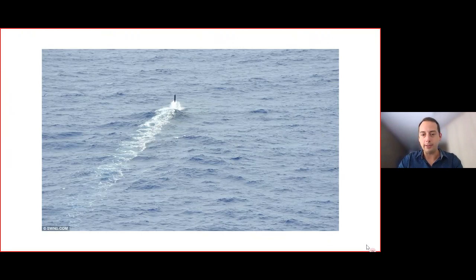And in many ways, this is how we look at the proteome today and have been looking at the proteome for the past 2 decades. The idea being that we see some parts of the proteome, but we are also keenly aware that certain parts of the proteome remain hidden from us. And so one of the nice things that we can do once we have machine learning tools available is that we can get a broader picture of all of this proteome information that is currently remaining hidden. And so that is what I'm going to be focusing on in my talk, how we are going to get a better view of the proteome through all these tools.